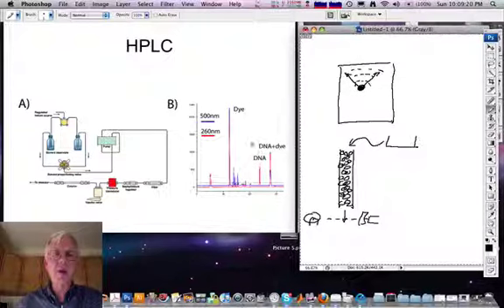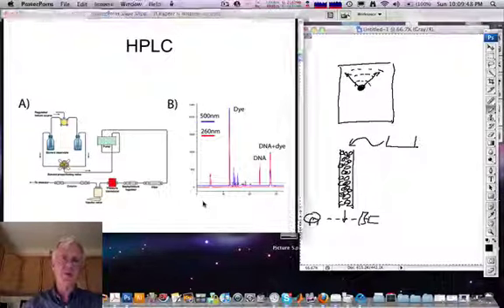However, when we carried out the coupling chemistry, in addition to these peaks, we found an extra one in the light absorption as a function of time that products elute off the column, and this was the DNA plus the dye. So having found out at what time in a given solvent this product elutes off the column, one can then make a lot of the reaction mixture and then just collect around this time to obtain a purified product.